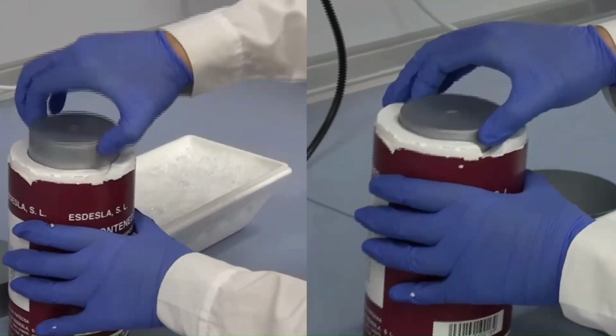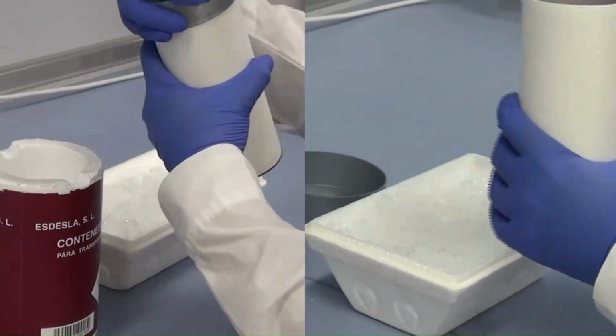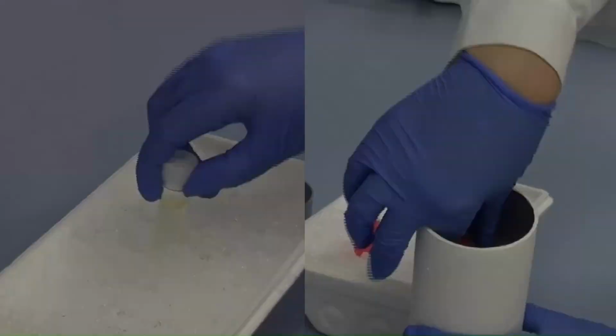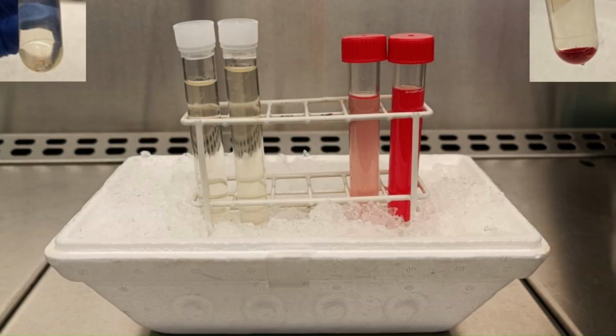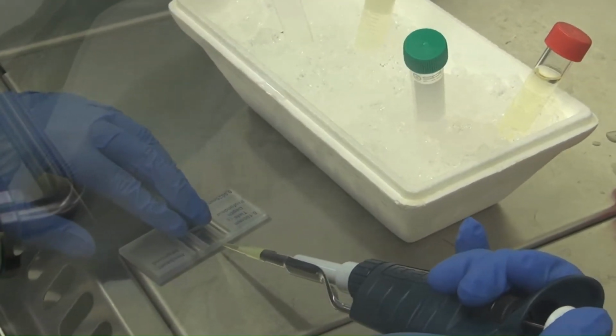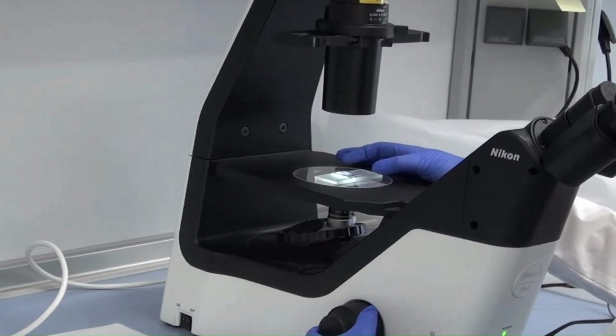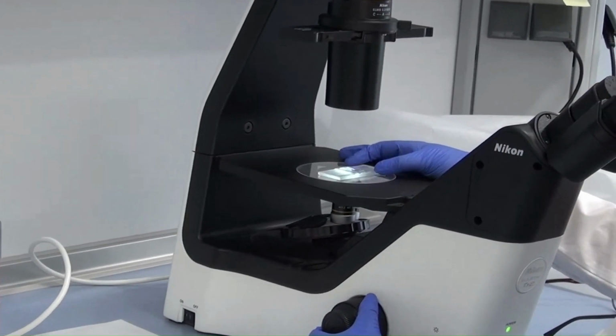Once at the laboratory, the appearance of the samples should be checked and then immediately placed on wet ice. Then they are centrifuged in order to separate the supernatant from the cell portion. After that, cell concentration is determined using a Neubauer hemocytometer chamber by light microscopy, discarding the dead cells by trypan blue exclusion test.